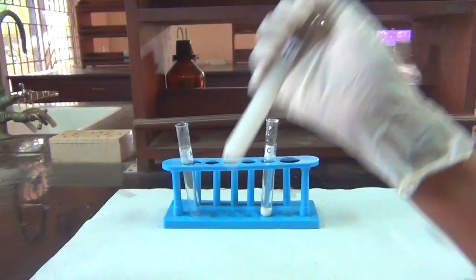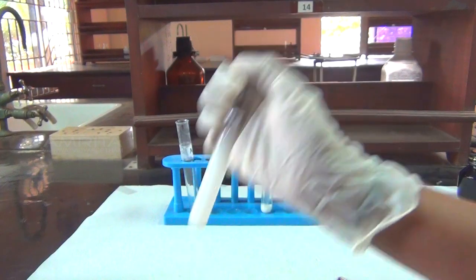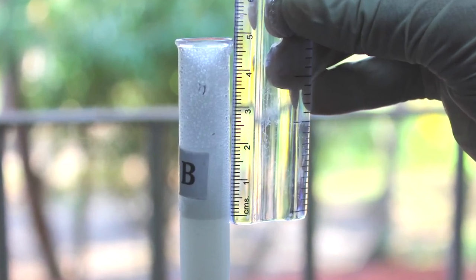Shake test tubes A, B and C equal number of times and in the same way without spilling any soap solution. Immediately measure the length of foam produced.